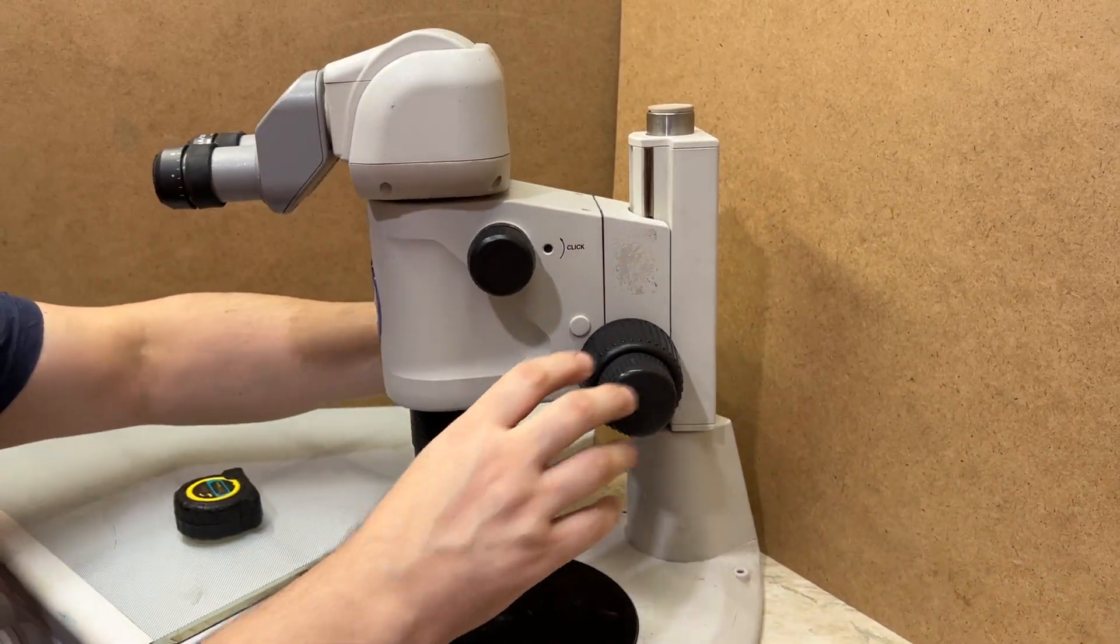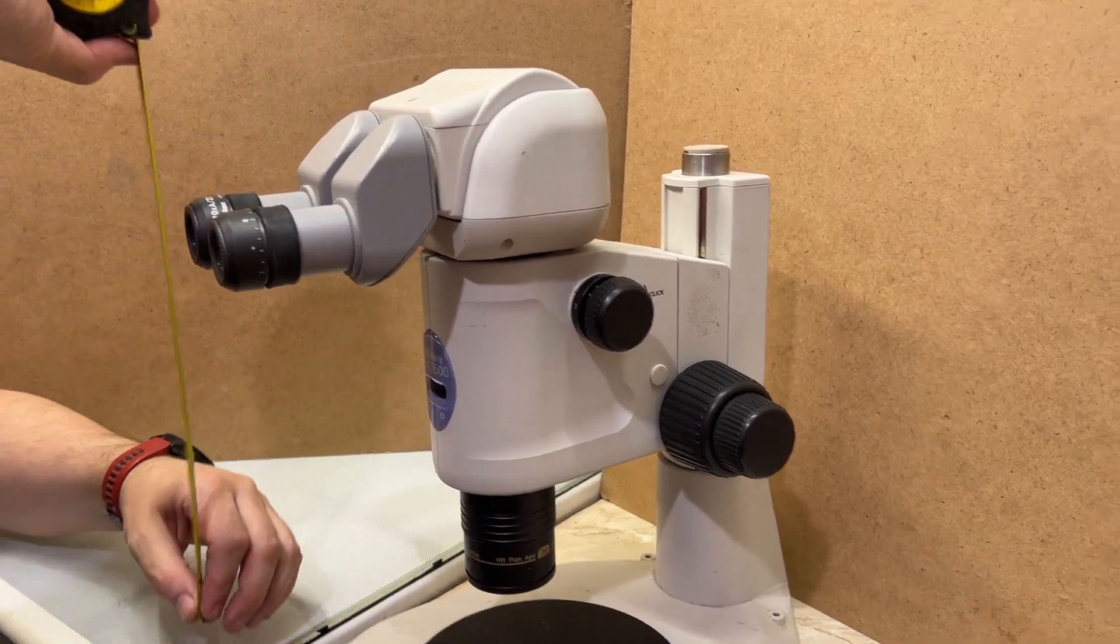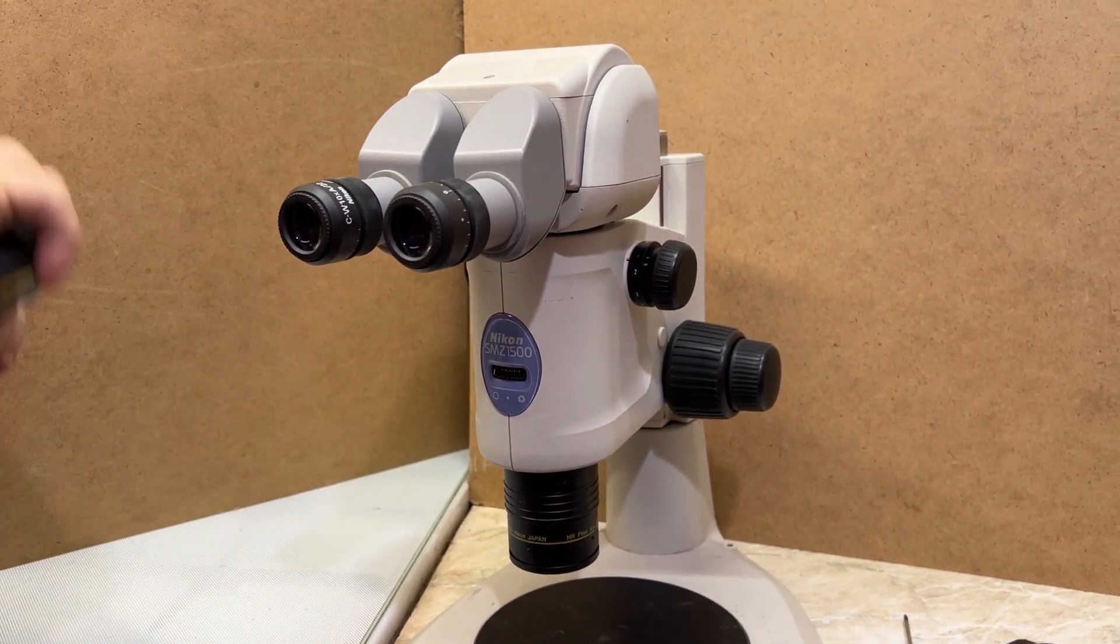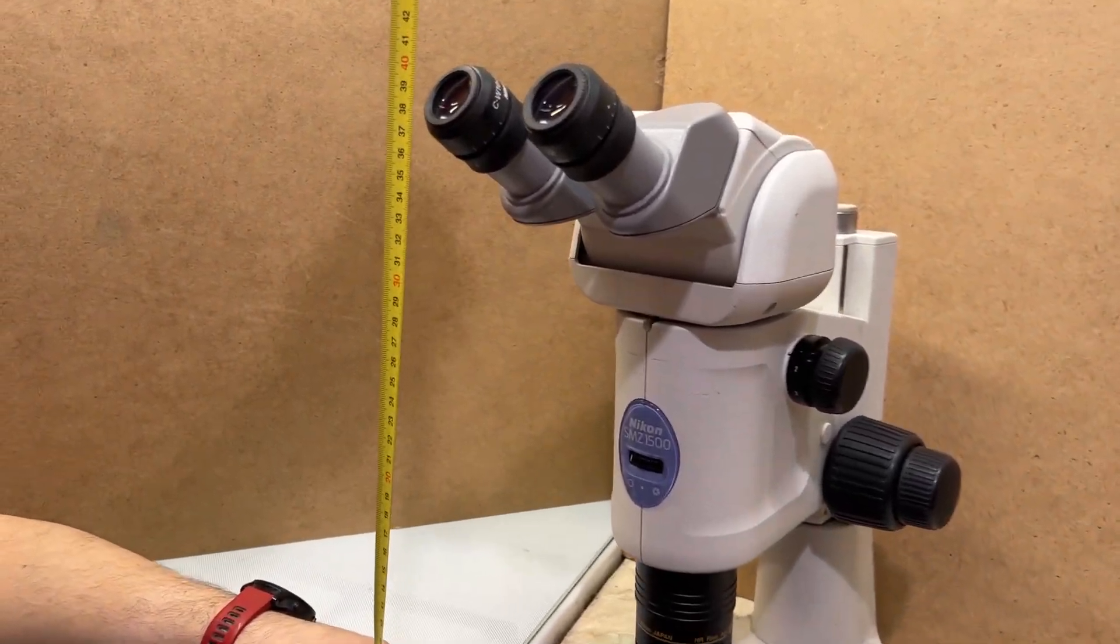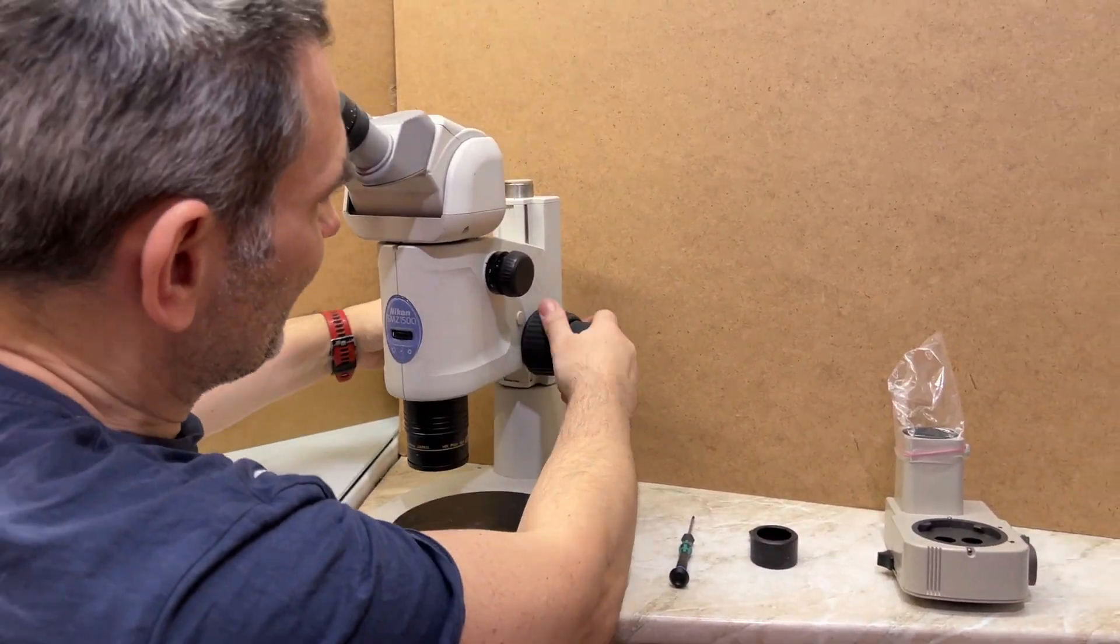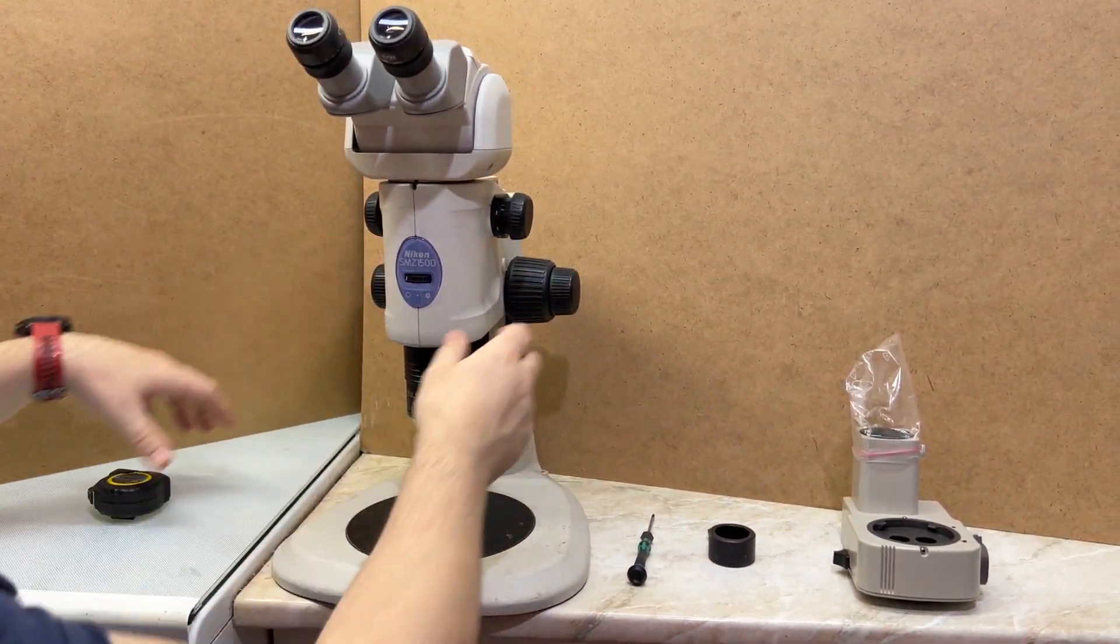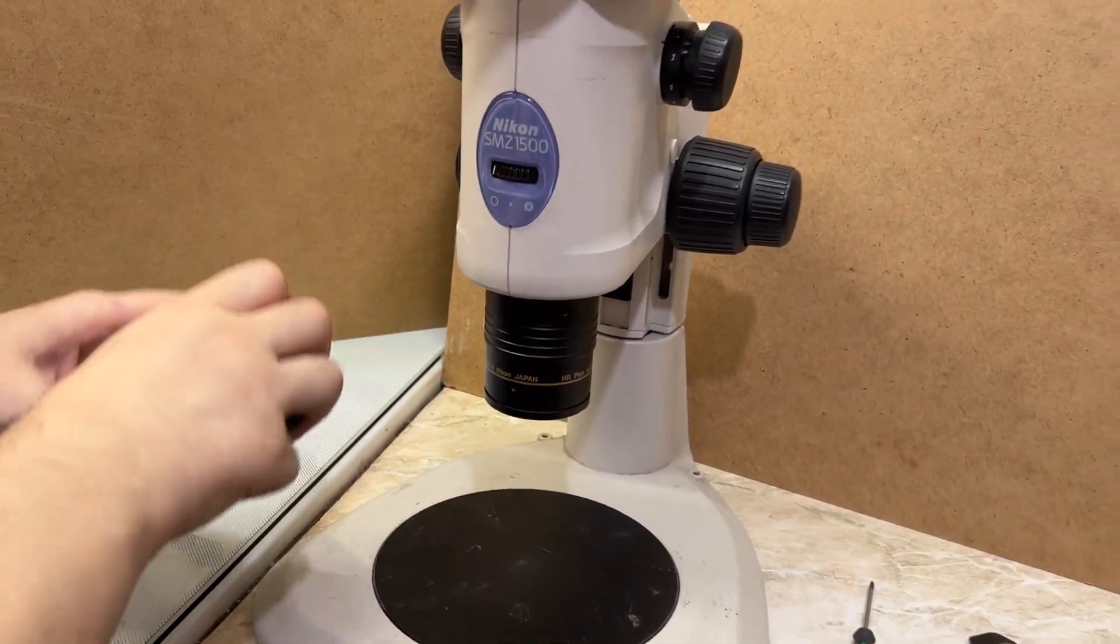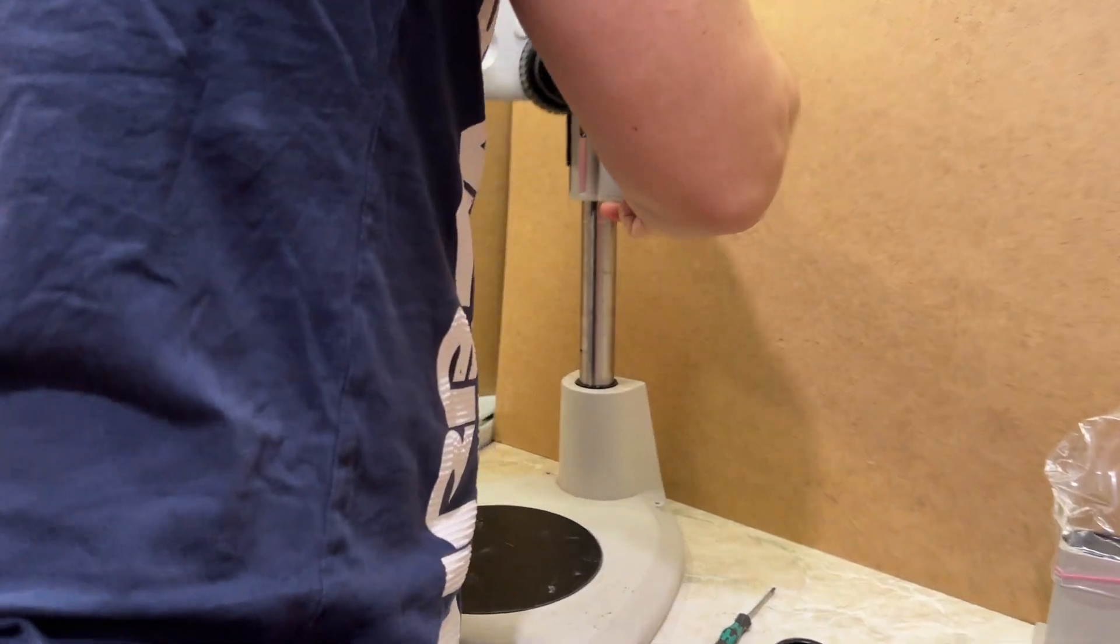After that we can see our travel path and height. The height with the lower position is about 29 centimeters. The upper position is about 39 centimeters. The height we can reach with the focuser is not that much, frankly only 11 centimeters. But don't forget nobody restricts us from using this ring.